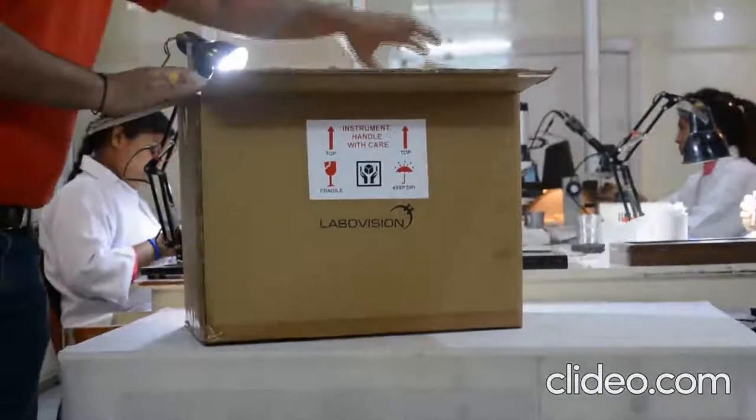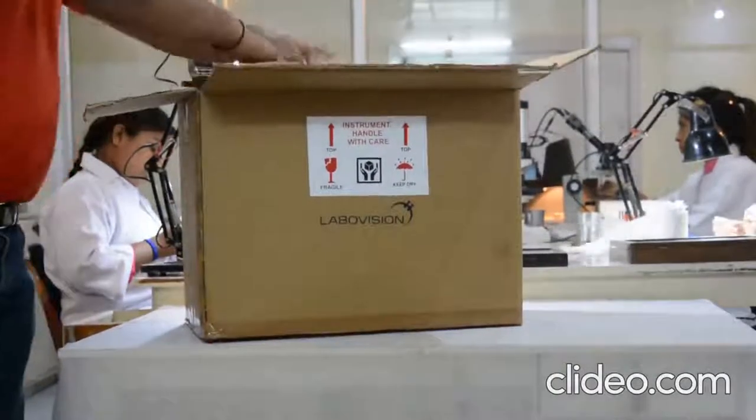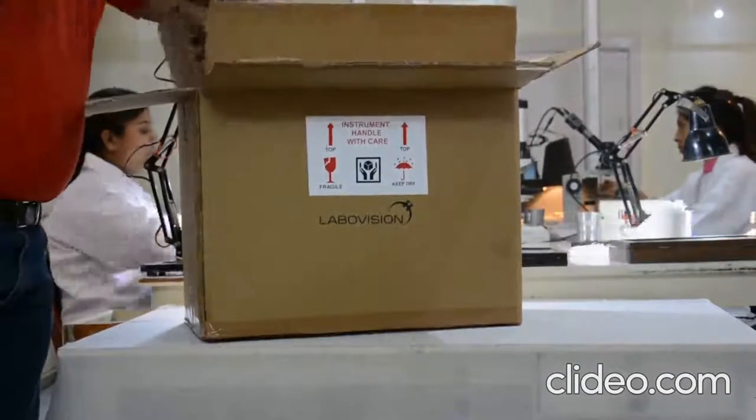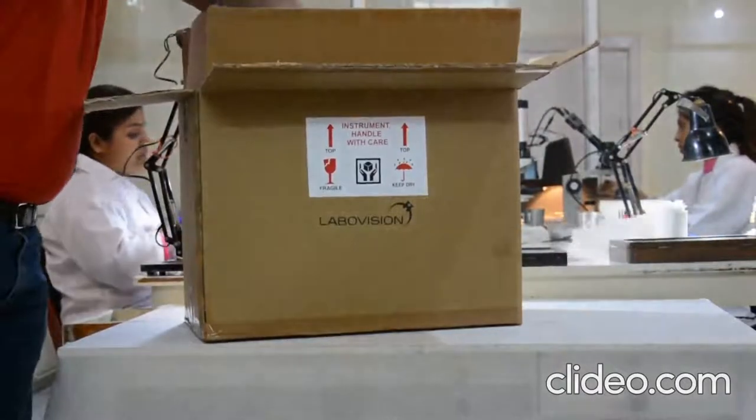This is the outer box of the microscope. We will carefully take out the microscope.